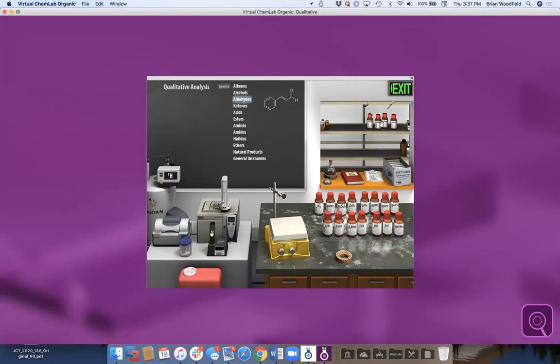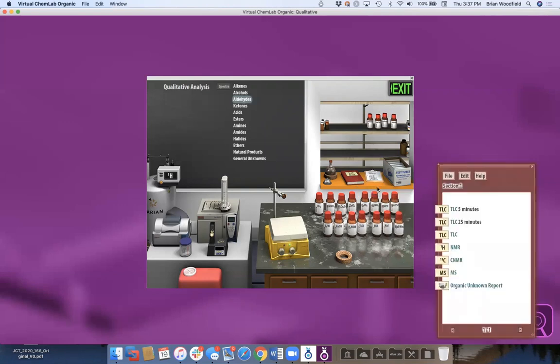Yeah, so if they're doing general chemistry, you can have all their titration data and inorganic data and gases, it's all in one file. And so you can really see a general picture of what they've learned throughout the whole year in one file. The lab books don't share between general chemistry and organic chemistry. Right. But within each product.